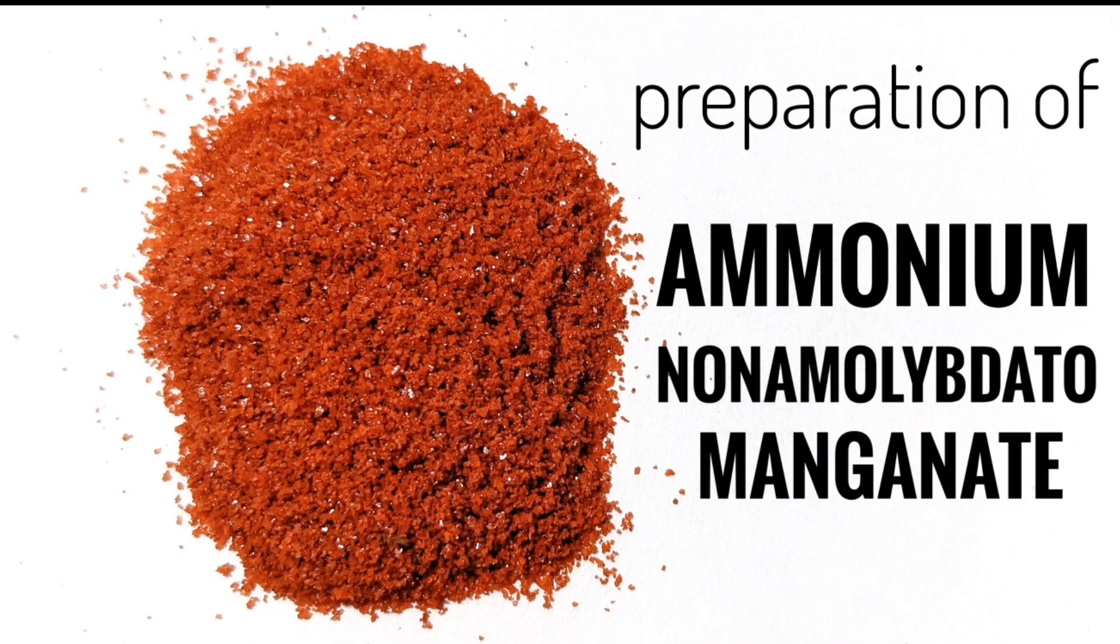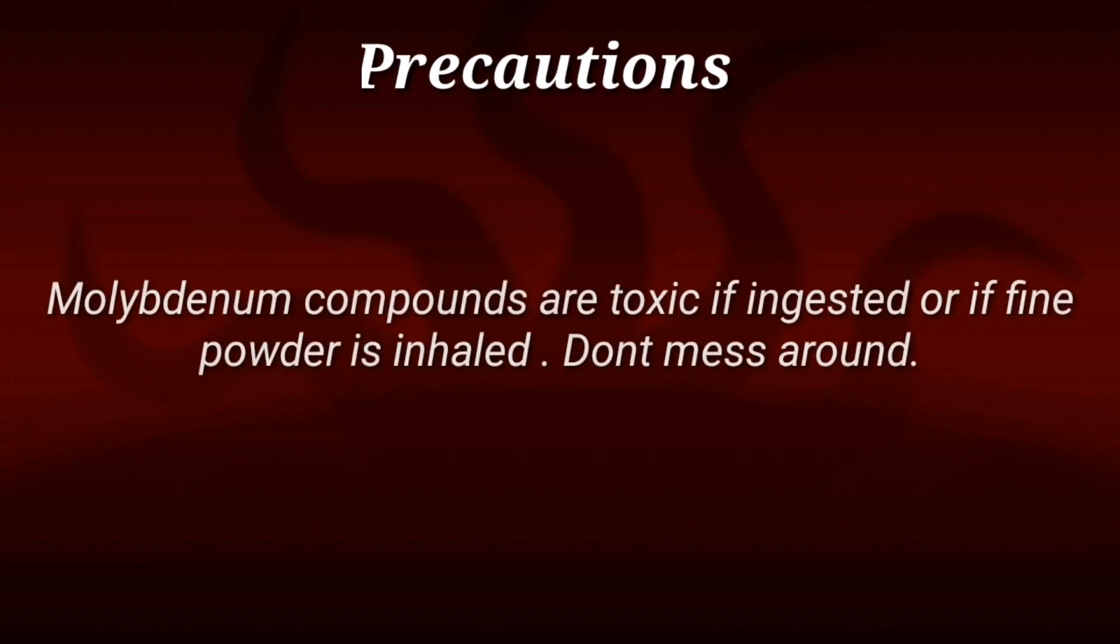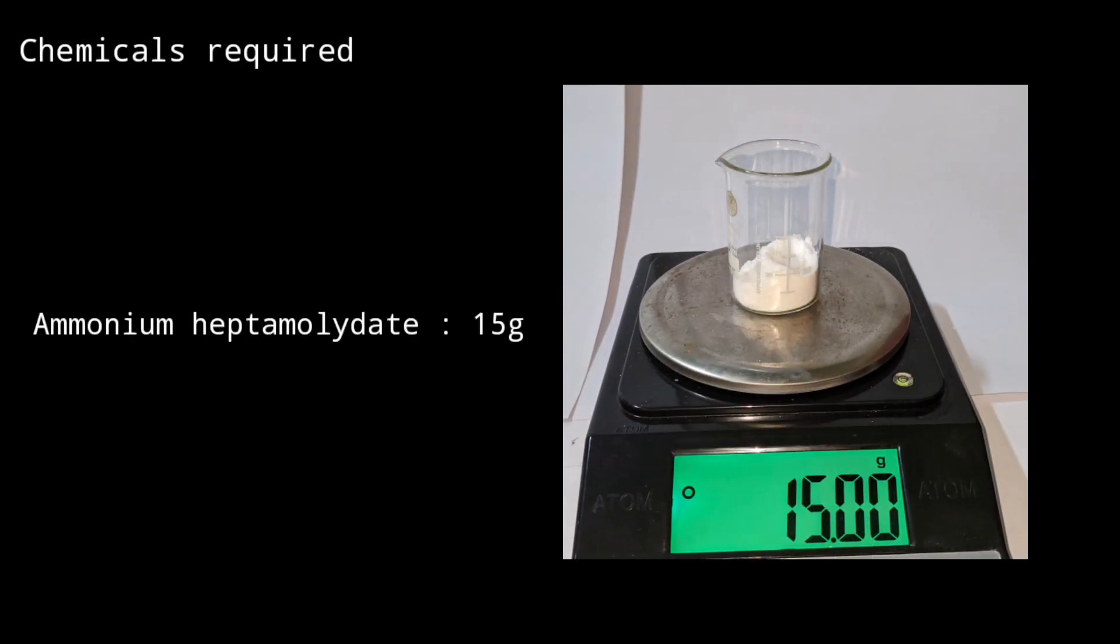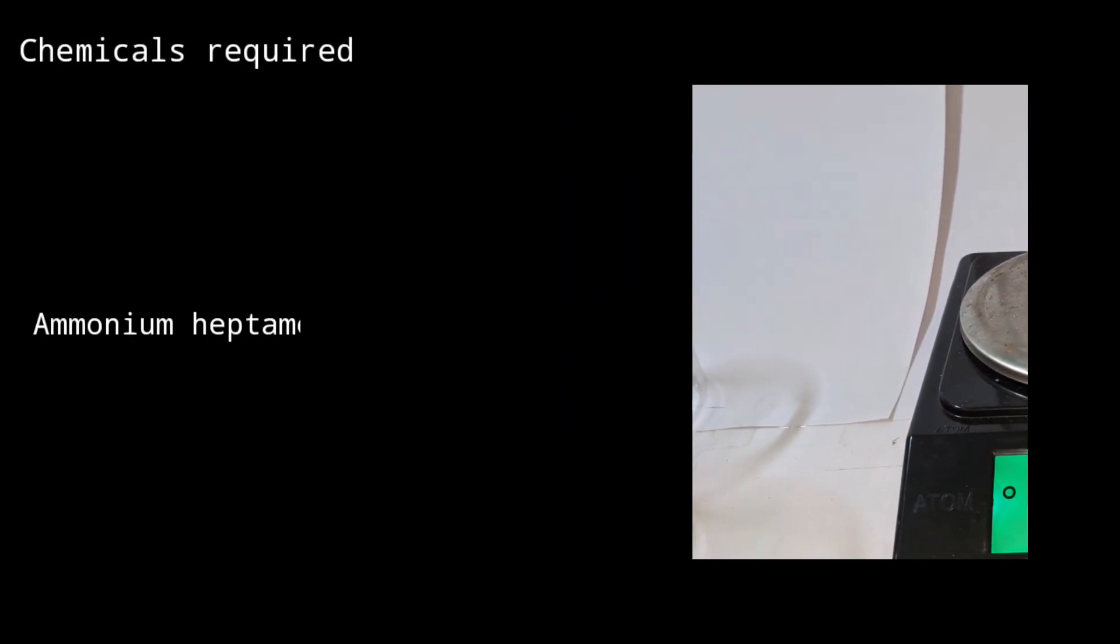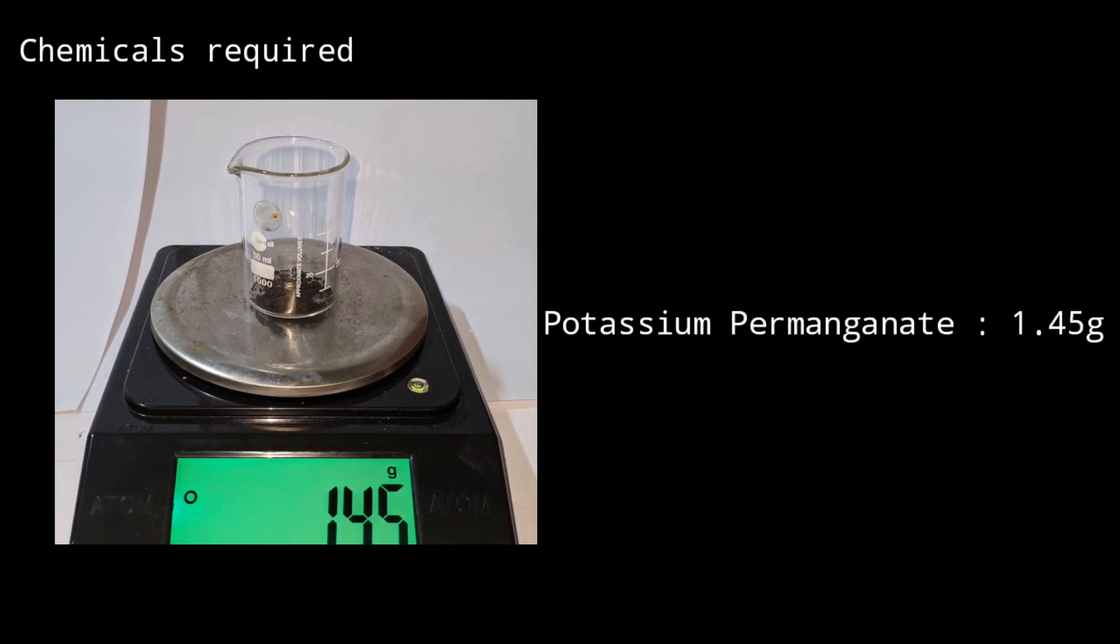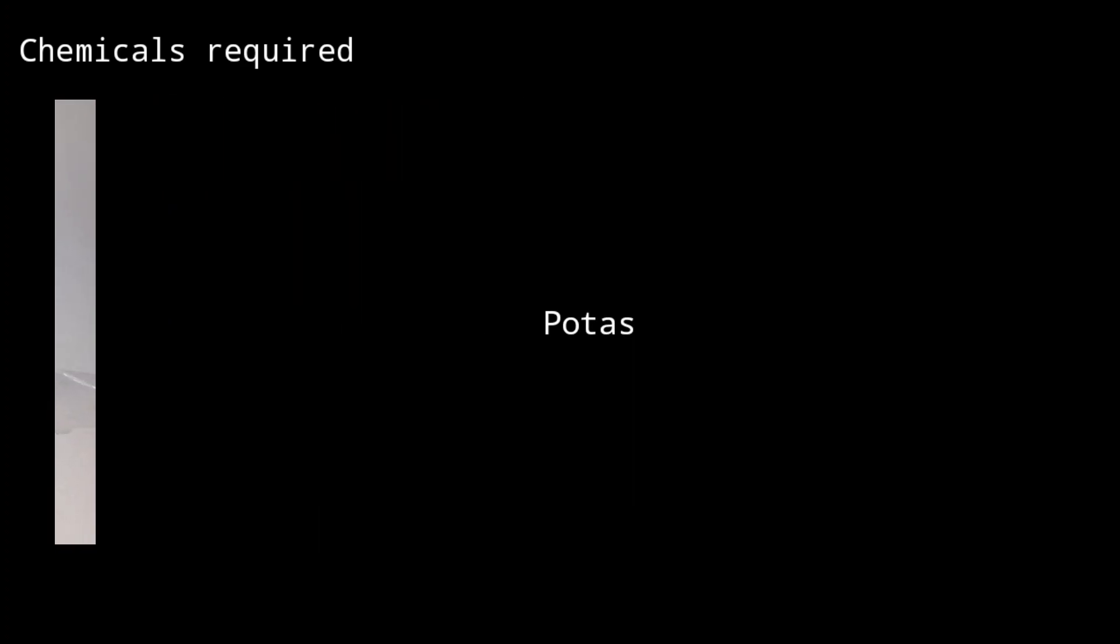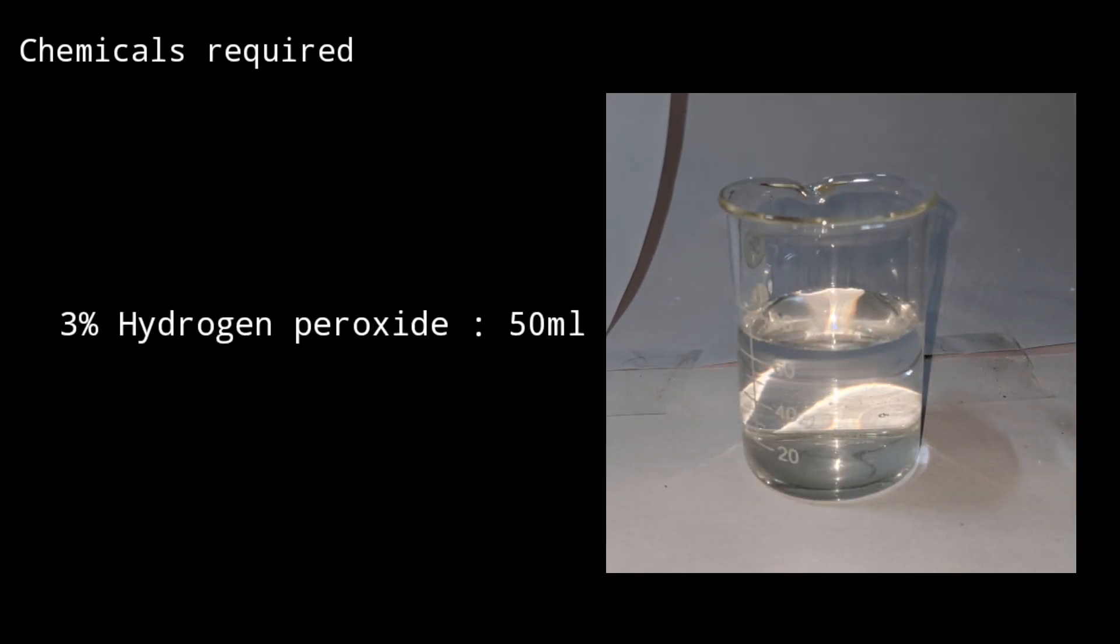Hello friends, in this video we will be making the polyoxometallate compound ammonium nona molybdomanganate. Chemicals required for this experiment are 15 grams of ammonium heptamolybdate, 1.45 grams of potassium permanganate, and 50 milliliters of 3% hydrogen peroxide solution.